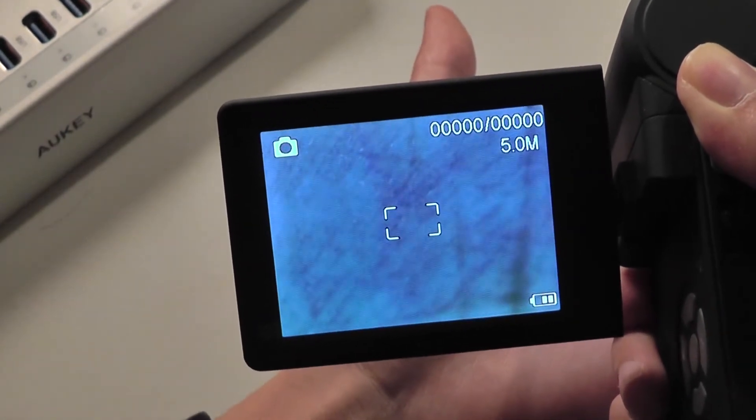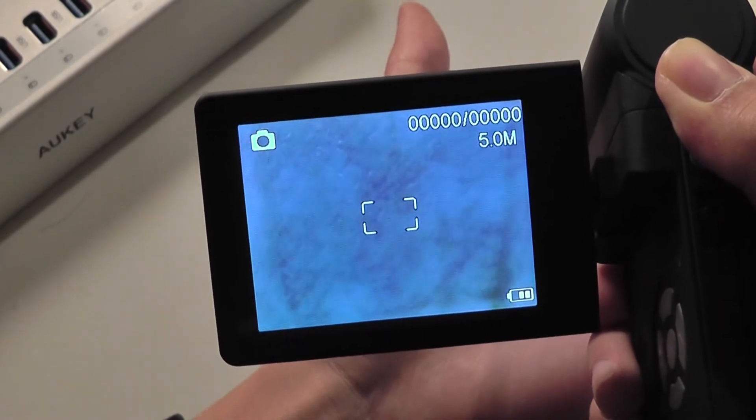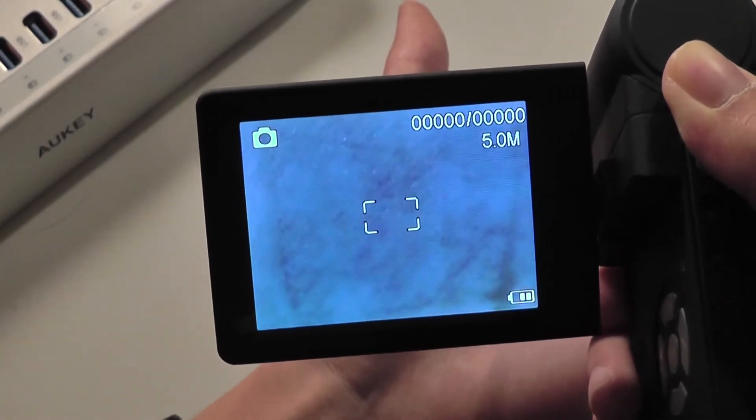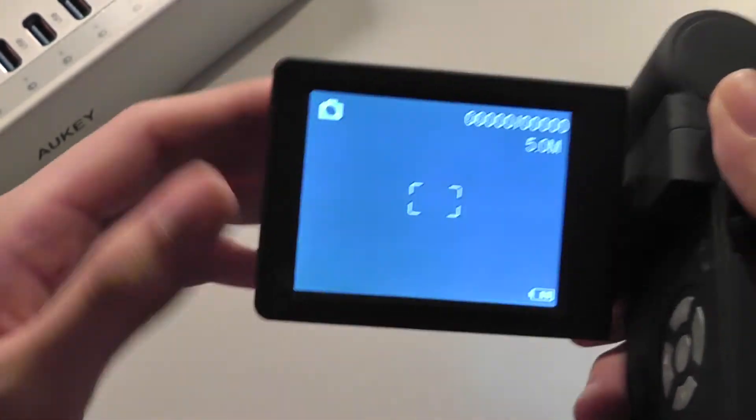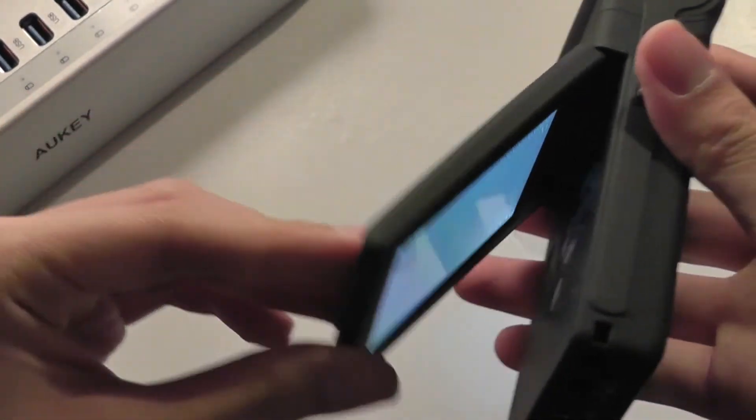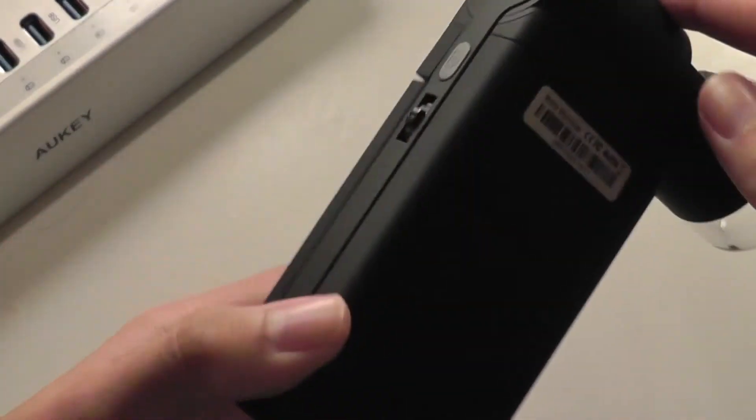You can get things to be a pretty crisp resolution. You can change it. This is five megapixels right now. You can get it even higher if you want to, up to 12 megapixels, which is very impressive. I can take an image of that and then take it out. After when I'm done, I can simply put it back in and the device will automatically turn off.